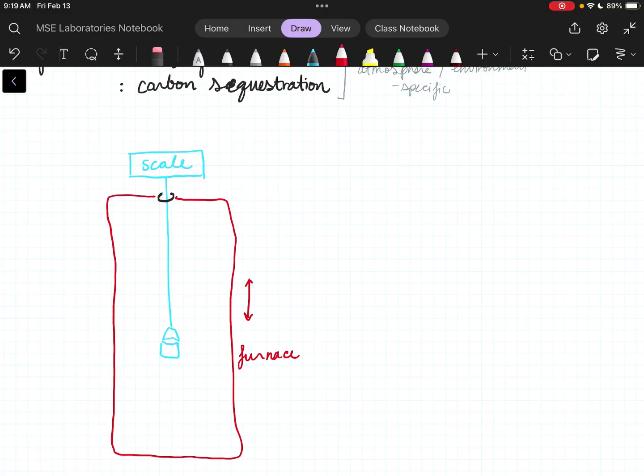I'm assuming it's shielded because heat does mess with scales like that. Most scales, yes. So there'd be a seal right here. I probably would draw that smaller. Or an Atwood machine. Have the thing pointed sideways and off to the side. So we're going to talk about that. That's the higher tech version. It takes a lot more effort to have the weights sticking out to the side versus dangling down. And we're going to talk about both.